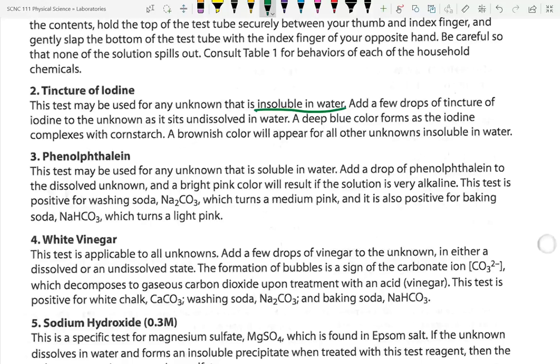Now, the next thing. For all of the stuff we're using, I am pretty sure that Ken said we can wash it down the sink. Disposing of chemicals is always something we need to be careful with, but we are not using anything that is problematic as far as I know. So, make sure you're running water down the sink. And then pour it down the drain so we don't get residues in the sink. Pour it down the drain, rinse it, pour it down the drain.